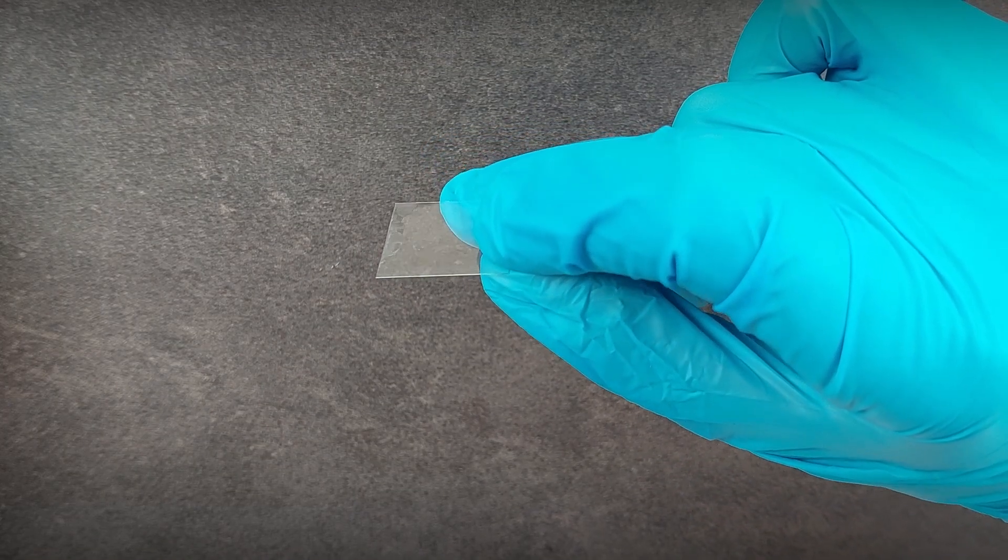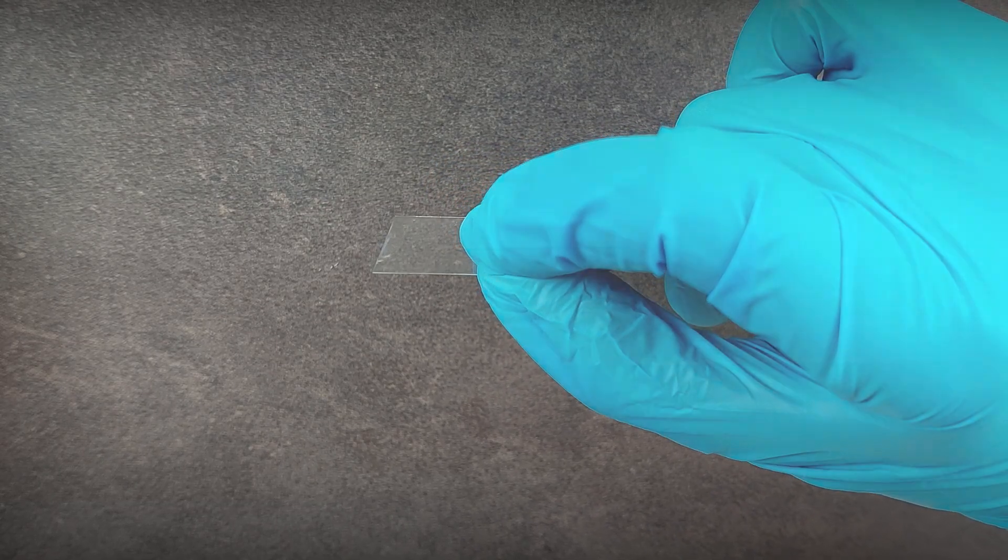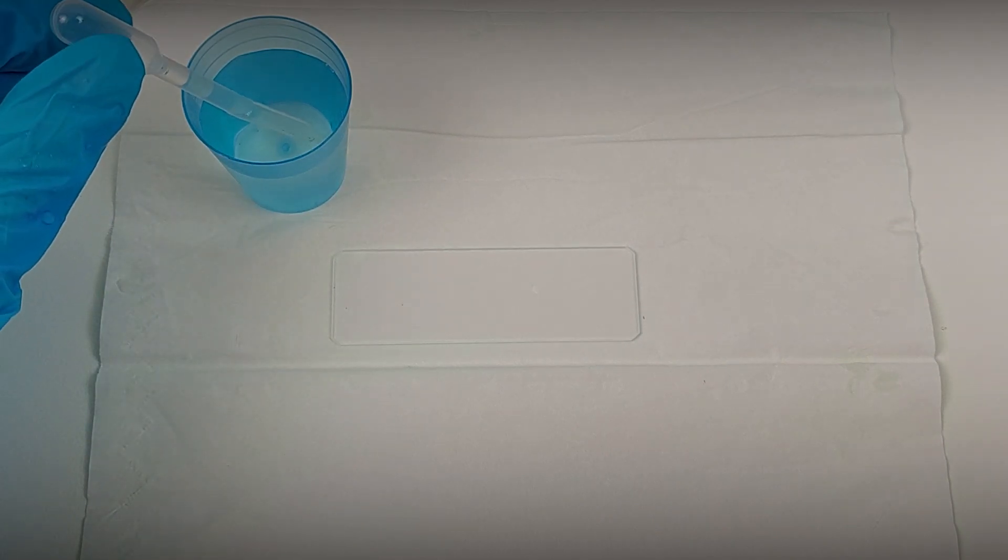A sample of slime and perhaps a few scales will be left on the glass. Use a pipette to put a drop of aquarium water onto the middle of the slide.